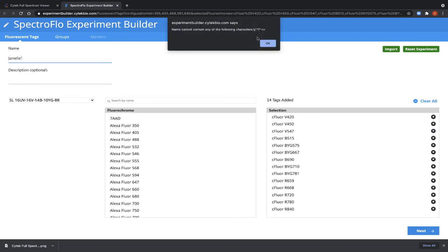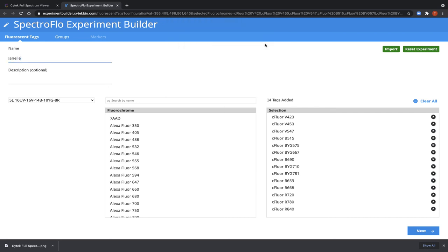And I typed an apostrophe and it wasn't happy with me about that. So there are some characters that are not allowed in the names. And that pop-up message scolded me for doing so. So let me rename it as Janelle Test Experiment.